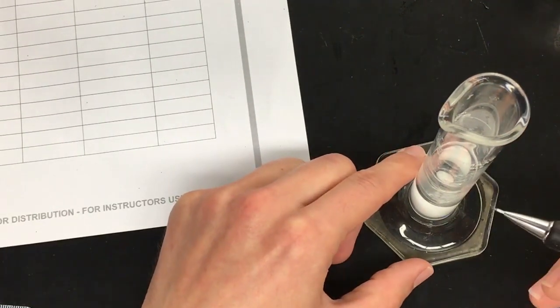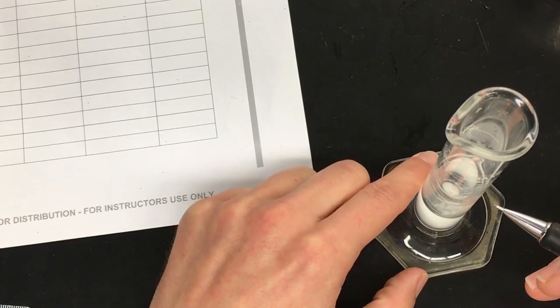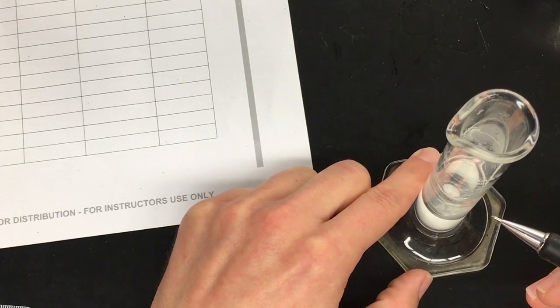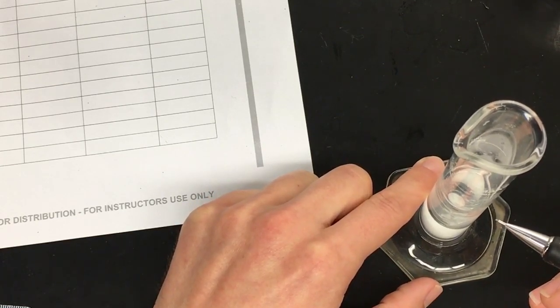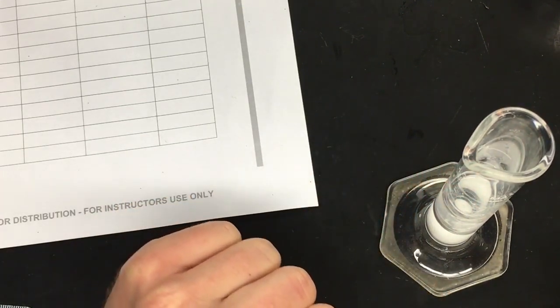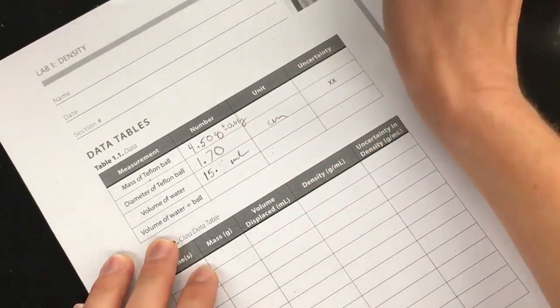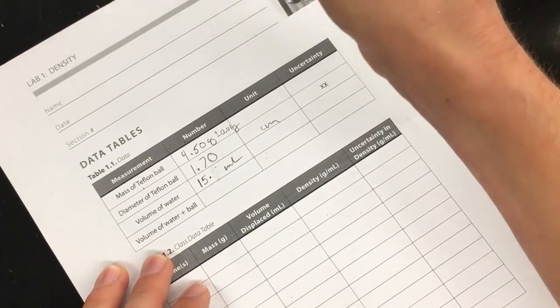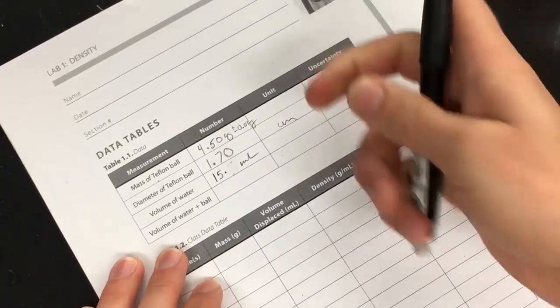Well, to me, it looks like, oh, you know what? I'm just now realizing the spacing on this. I messed up on my last measurement. That mark that I showed you that I said was the 16 milliliter mark, it was actually the 15.5, which would mean that my first initial reading, you know, scientists mess up every day, it means that my initial reading was actually 15.25.